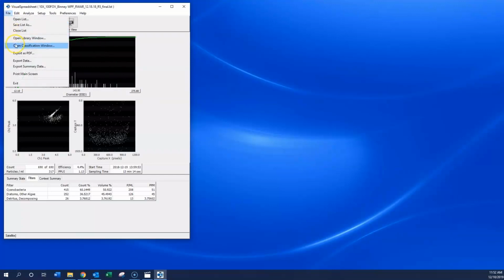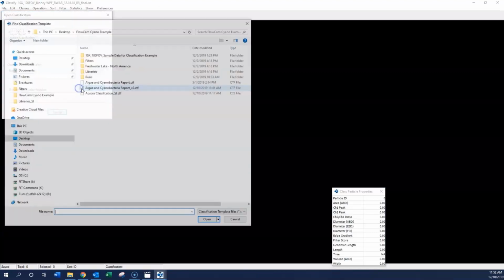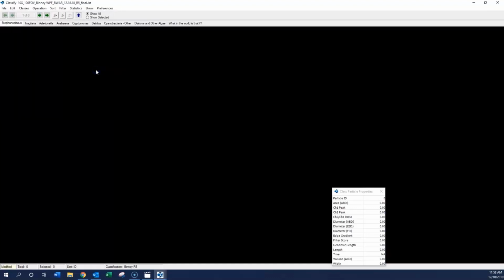What we're going to do is open a reporting tool now, which demonstrates how this is possible. And this particular tool is used by a variety of different agencies, depending on the type of application. So this is a blank template at the moment, and it creates a representation of the organisms in the sample.